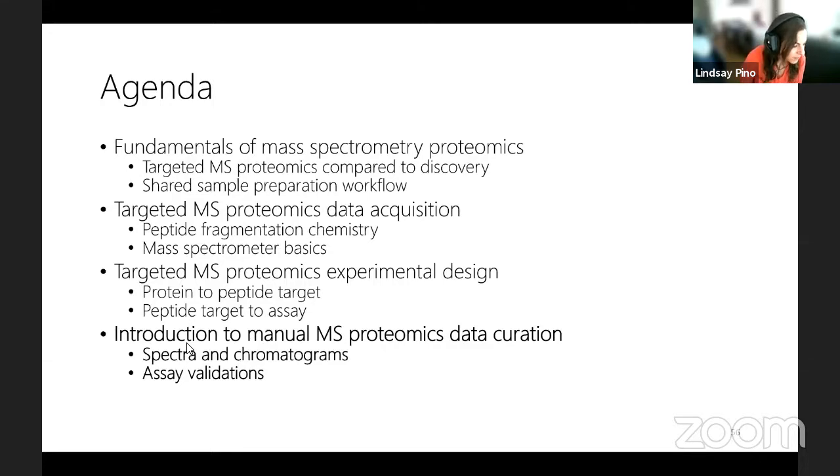So going back to fragmentation, does it matter if the 3 to 5 fragments used for peptide ID come from the Y series or the B series? It doesn't necessarily matter. I've been showing a lot of Y because a common fragmentation method produces intense Y fragments, but there are other ways you can use a mass spectrometer to fragment precursor ions that would give you different series. So really you just want to pick the most intense fragment, no matter which fragmentation series it came from, and ideally in the middle of the precursor.